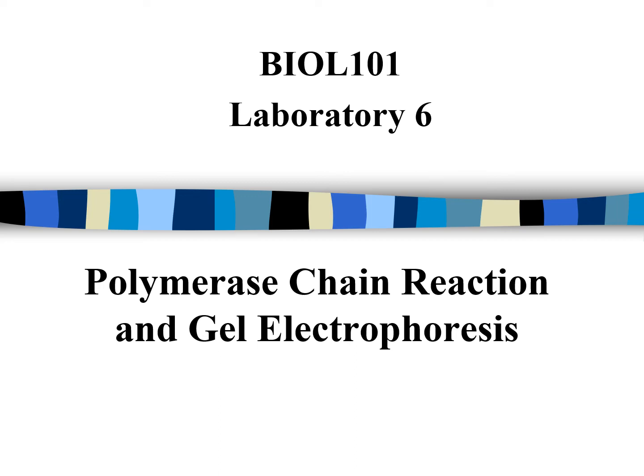So for today, we're going to talk about experiment number 6, which is called polymerase chain reaction and gel electrophoresis. So polymerase chain reaction, or as abbreviated, PCR. PCR stands for polymerase chain reaction.